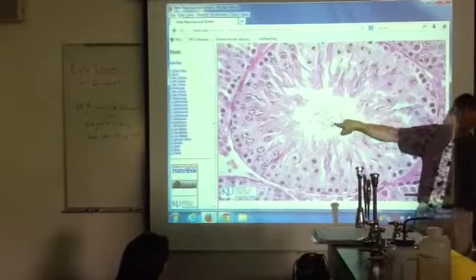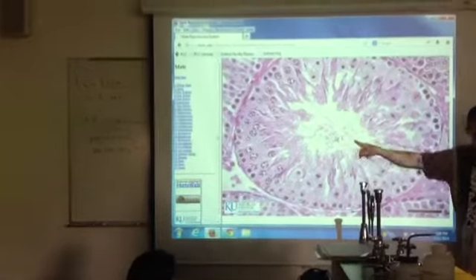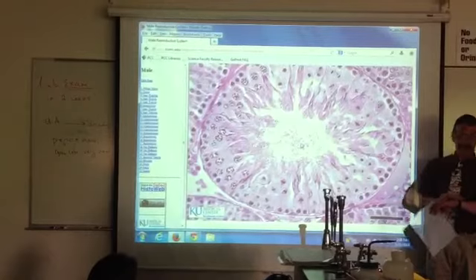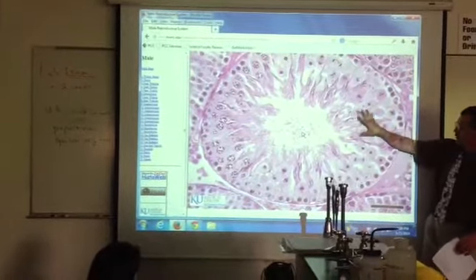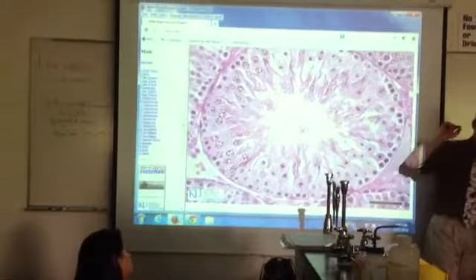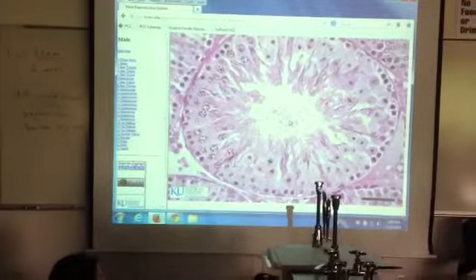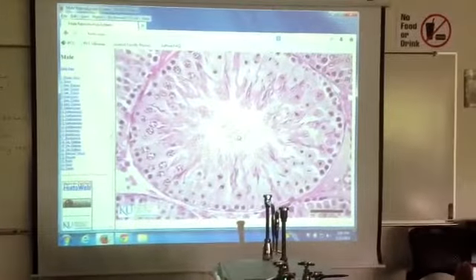When you're in the center in a testis, those are sperm what? Tids. Because they're immature, they become sperm formally out of the epididymis. So next week, you can't just say sperm. You've got to say spermatogonia, spermatocyte, spermatid, or sperm, depending on what we're talking about. That's the level of detail there. But otherwise, you kind of know this, right? The fun begins when we do the girl part. Because now everything changes.